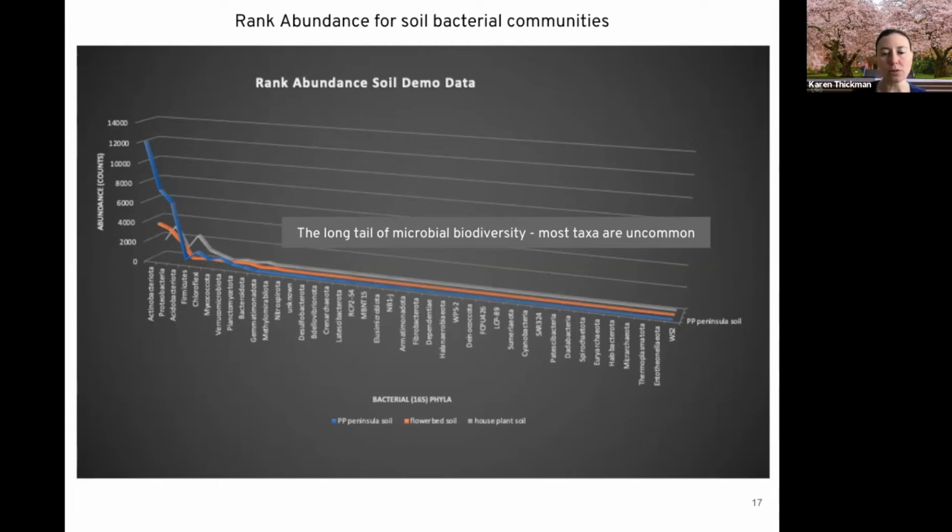Right? So those ones down there, how do you know? I know that from the rarefaction curve you can say that you've reached saturation, but how do you know that those ones down there aren't just random sequences or sequences that are misidentified, if all you're seeing is a few of them? So really, how do you know that those are real?